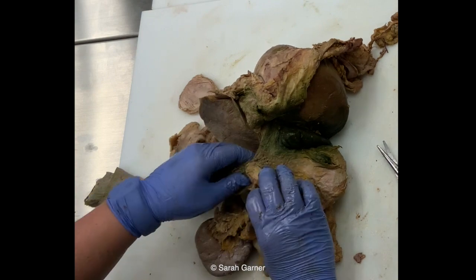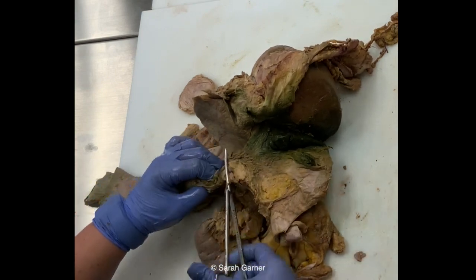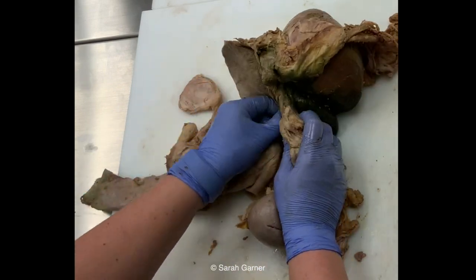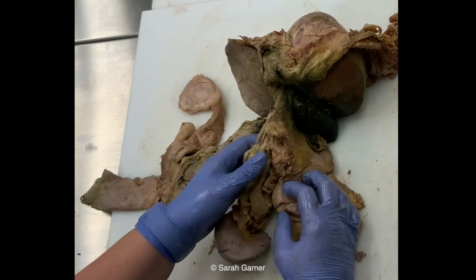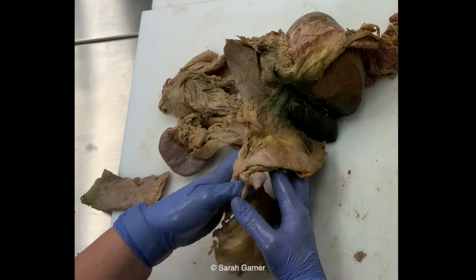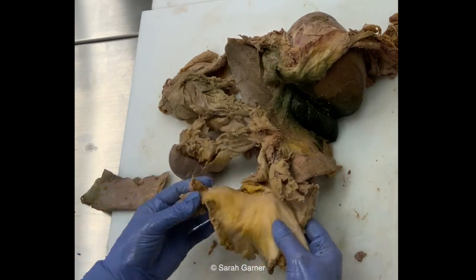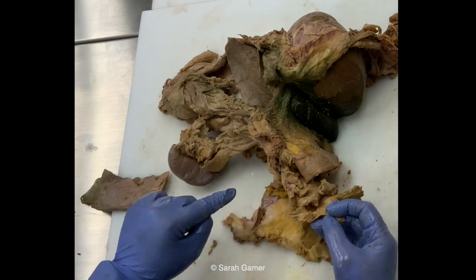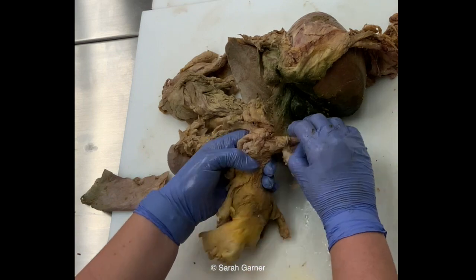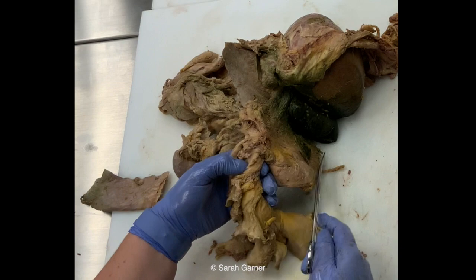So the last couple branches here, we have the celiac trunk vessel. Remember, your celiac trunk is going to have that left gastric, common hepatic, and your splenic. So all of that was still connected there. That's what I just detached. So we're almost fully detached. So what is this big hunk here? Remember when we cut out the intestines? That's where we cut. So this is all still attached because we didn't really leave the mesentery attached to the intestines, right? So this is basically the superior mesenteric vessels and then all of that attached mesentery. So we don't need that.